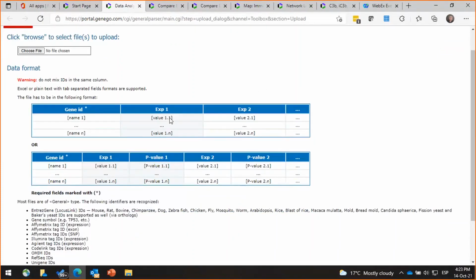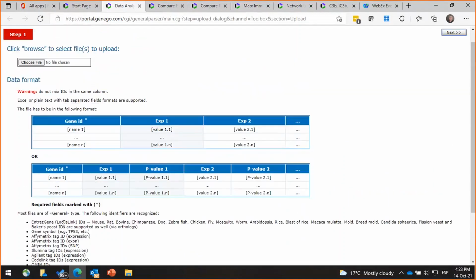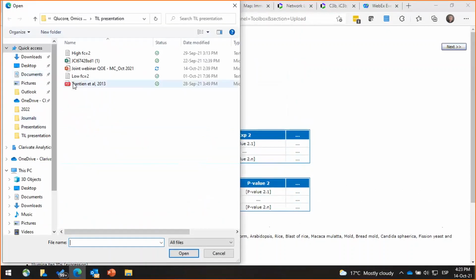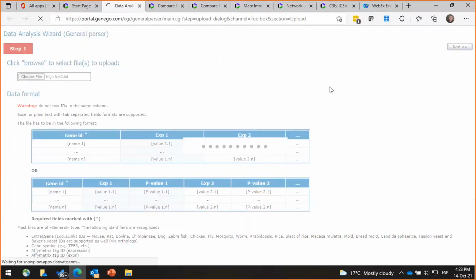So you can see here that various different files are accepted and they're recognized and matched with the content that's in MetaCore. The format is explained on what needs uploading, and today I'm going to choose the file, come across here to this one which Anne just prepared, and I'll open that. You can see it highlighted here in this field, and I go through to the next step.